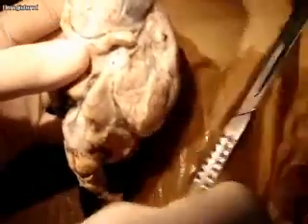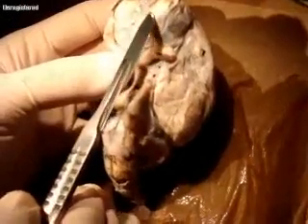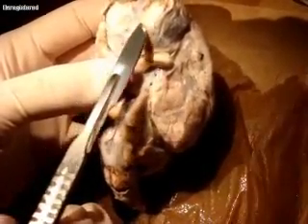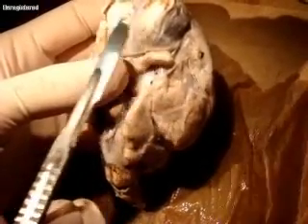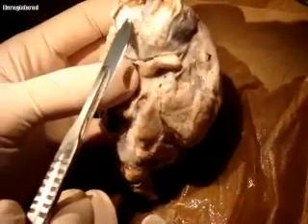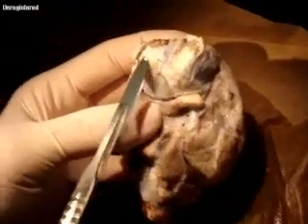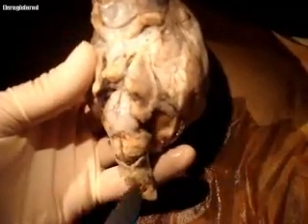All right. Right up here on the top, this part of the brain right here on the top is the part that's sitting right up above your nose, right near the ethmoid bone. And so this on each side is the olfactory bulb that allows you to smell. So olfactory bulb, optic nerve, right? Optic chiasma here, optic chiasma, and then this would be the pituitary. And then coming down, going toward the brain stem.